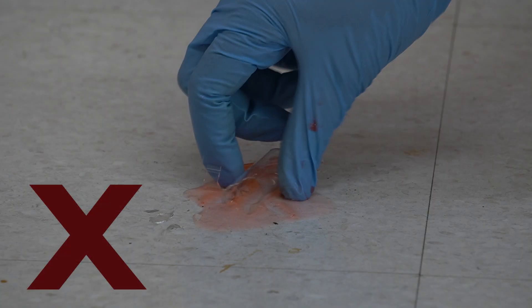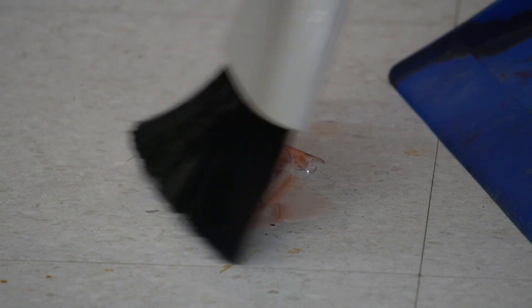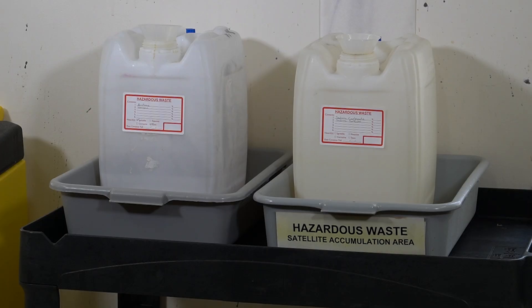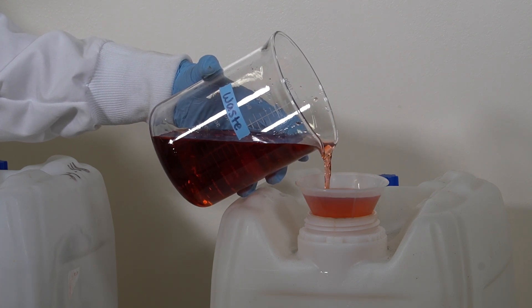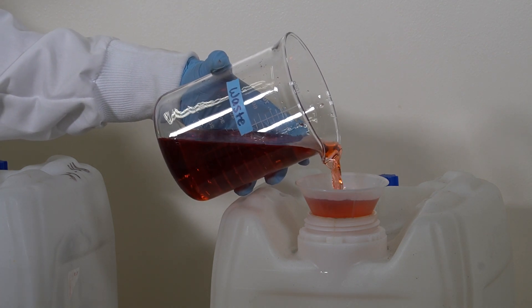Please, never try to clean the contaminated broken glassware. You do not want to be scratched by glass that contains potentially hazardous chemicals. Most of the waste we generate in the lab is liquid waste. Therefore, we will highlight a few rules on how to handle liquid waste properly.